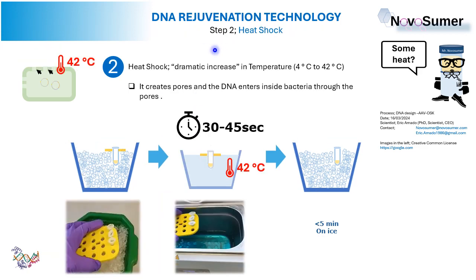Well, we are in the second step, the heat shock, increasing the temperature dramatically to create pores in the cells and insert the DNA through these pores inside the bacteria cells. Here we are. As you can see, we are going to increase the temperature to create pores and include the DNA inside the bacteria cells.